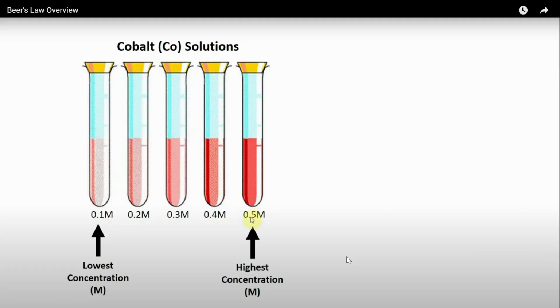Now, I've got my solute in here. What do I do next? Fill it 2/3 with water. Why do I not fill it all the way to the line? Because I have to mix it, and if I fill it all the way to the line, nothing really moves because the water's all the way up to here. But if it's only about half or 2/3 full, it can swirl. Then, once it's all dissolved, fill with water all the way up to the line, and then stopper it and mix it properly. Now we have our solution.